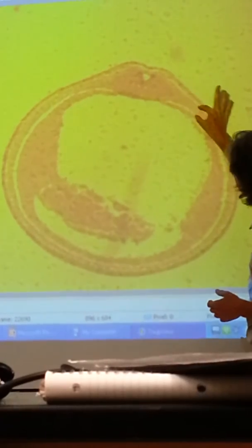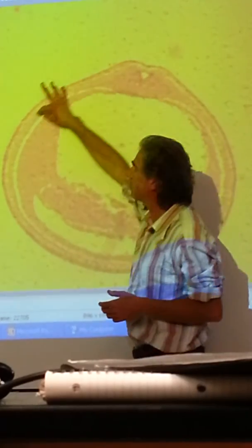Now, I never mentioned what somites are about. I just wanted you to first identify them. And on this, I can see here's a triangular strip, here's a triangular strip. Somites are mesoderm. What does mesoderm create? Lungs?